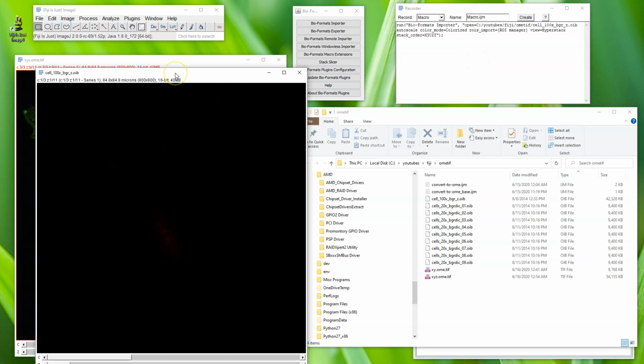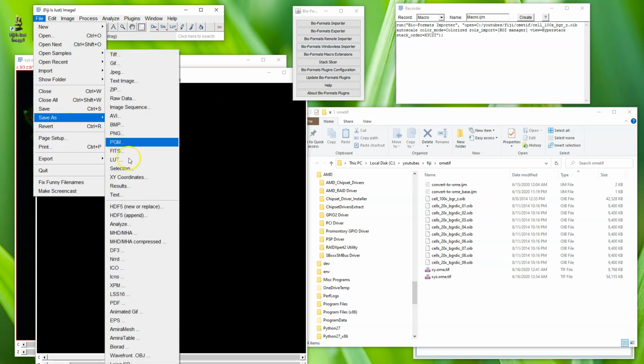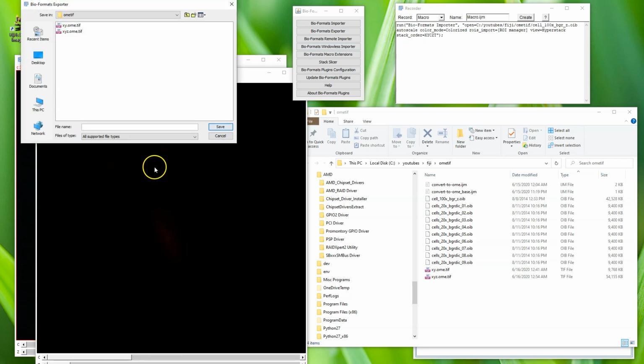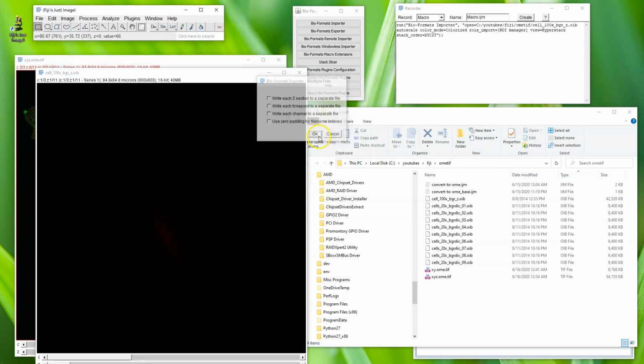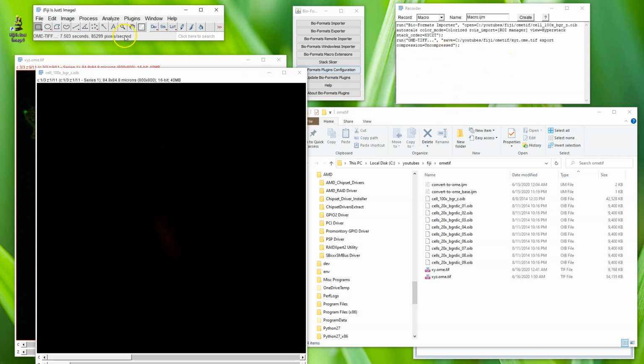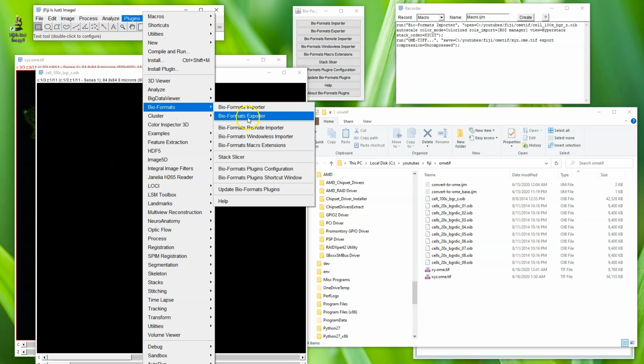And it's similar on the way out. If you use this pop-up menu, it doesn't give you a recorder option. It does give you an option if you use the save as ome.tif that's hidden down here that you can't see. You see it there. It'll also give you an option if you use the bioformats exporter from this menu here.